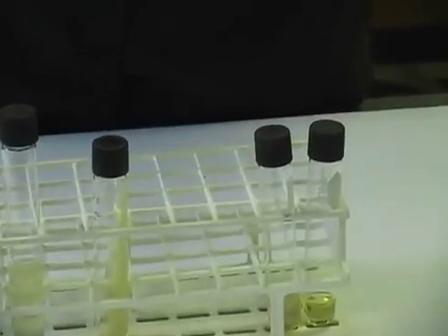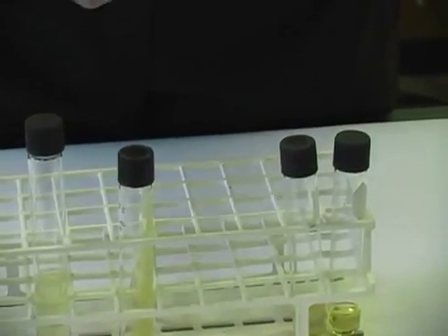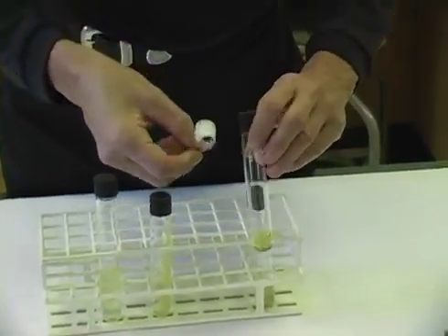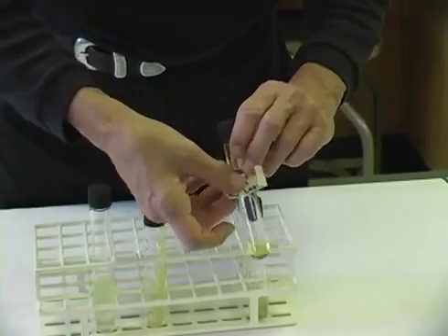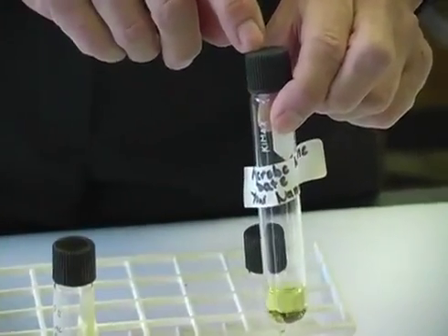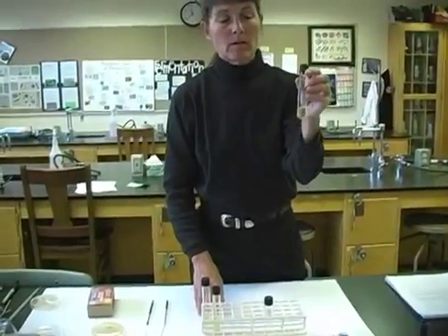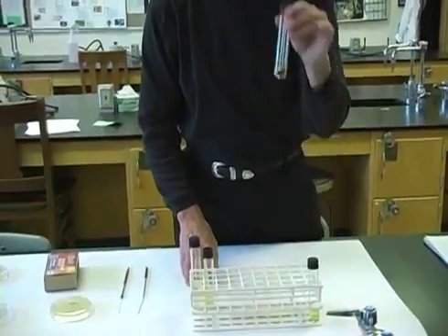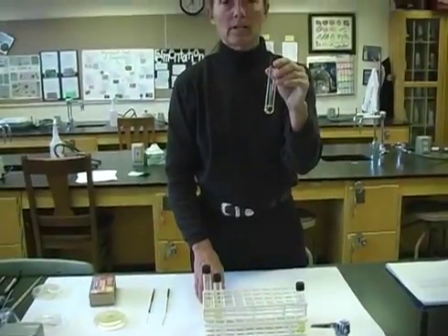When placing labels on broth tubes, the label always goes on the part of the tube in which the microbes are growing, in this case on the glass body. Labels do not go on caps. We frequently need to move or transfer our microbes from one place to another. For example, we may wish to transfer microbes from our broth culture to a fresh tube of broth.